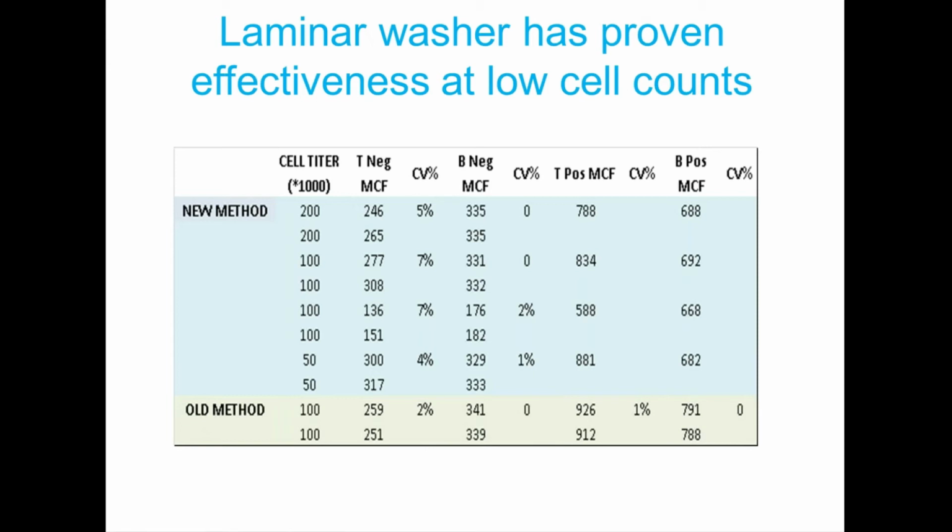And crossmatch results were the same between the Laminar Wash system method and our current method, and at all cell titers. This concludes that you can use the Curiox Laminar Wash system whenever you have low cell count. So there is no need to request more donor tissue or blood from your donor network. So there will be no more delay in allocation of the donor organ or a delay in transplant.